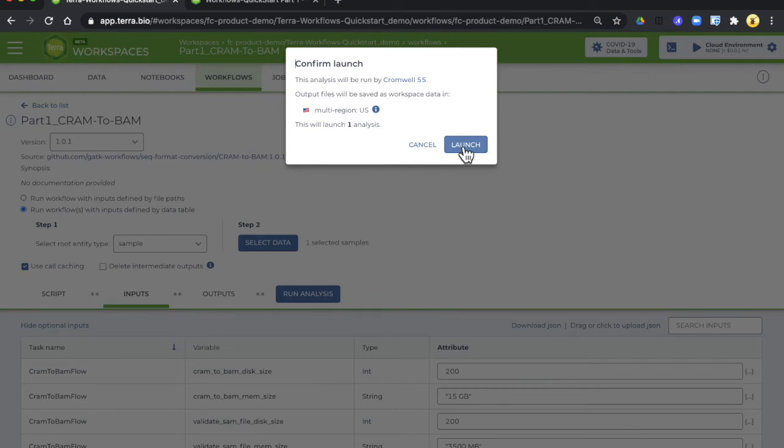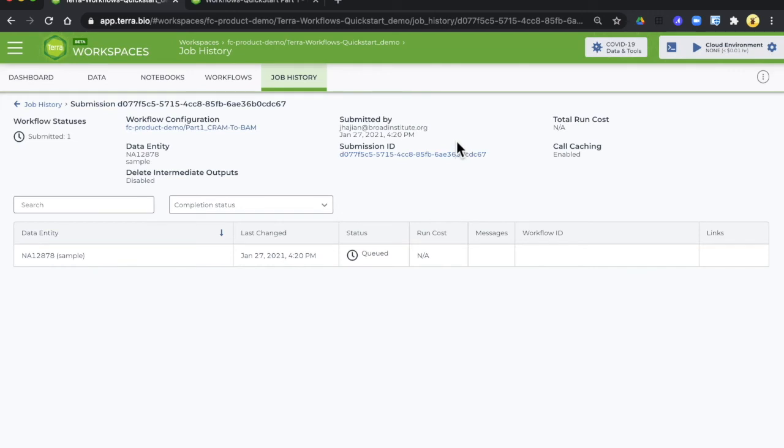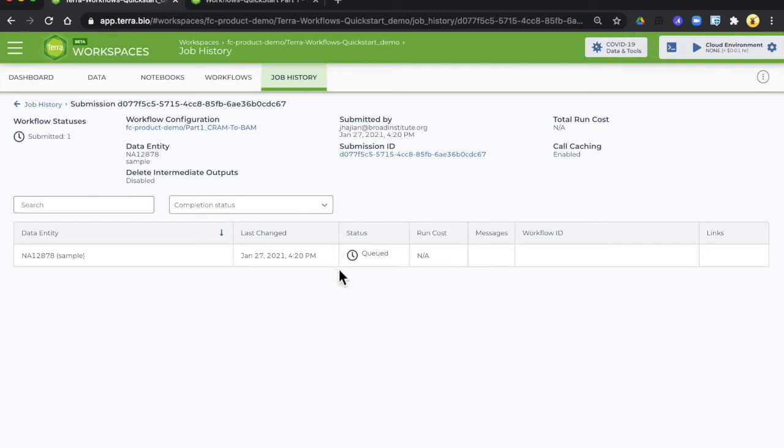So select launch and Terra will take you to the job history tab which gives you a running commentary on the status of your workflow right here. Notice that it's queued which means that it's in line to be run but not yet there.